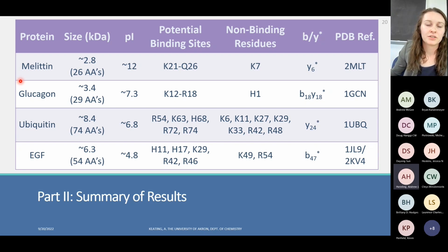Have you tried using something like paratoluene sulfonate, so you just have the monomer? Is there an advantage? I guess I haven't tried that specifically. At that point, I think that would be similar to doing, I think people do phospholipid tags. So it would be just a similar monomeric species. You lose out on the ability to then probe any distance between them.